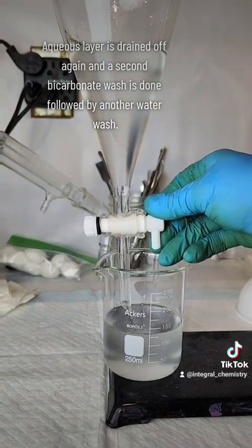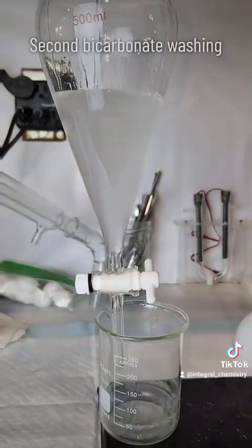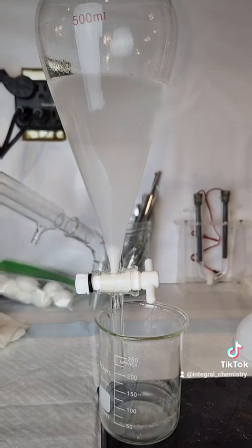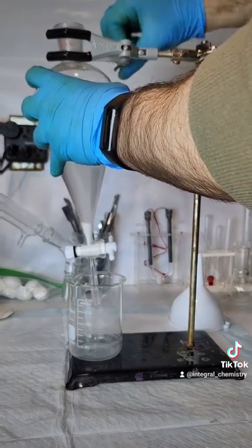DCM and chloroform are denser than water and will comprise the lower layer in a liquid-liquid extraction. With that one exception, I tend to prefer using ethyl acetate over DCM in any process where it's possible.